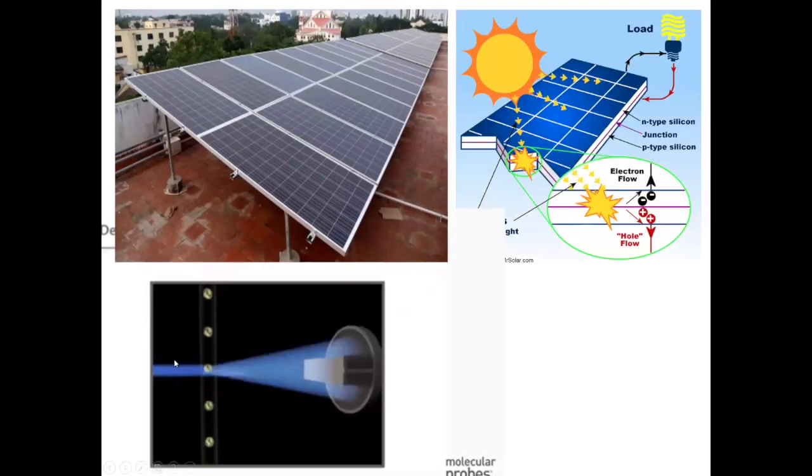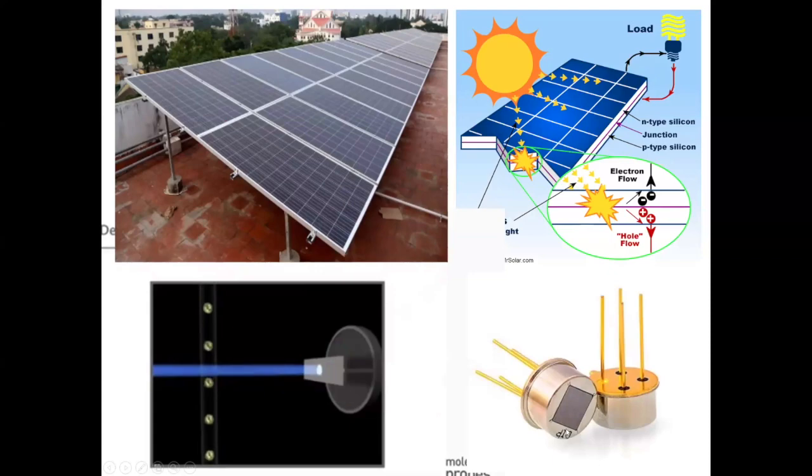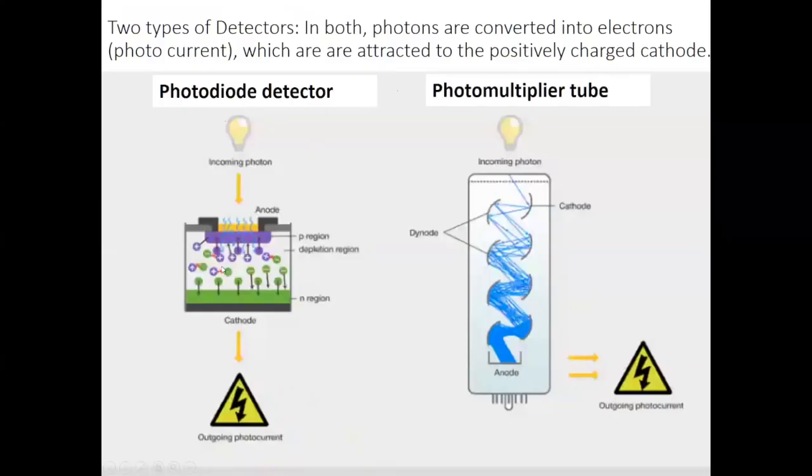So see, forward scatter signal is a very high intensity signal, because it is in the same direction as the light source, right? And you can use a photodiode for it, right? If I want to discuss all these things, you will go crazy. I'm not going to go into that physics. And this is a photodiode, how it is there in the machine. So this is a photodiode, which is very sensitive, used for capturing high intensity light like your forward scatter light.